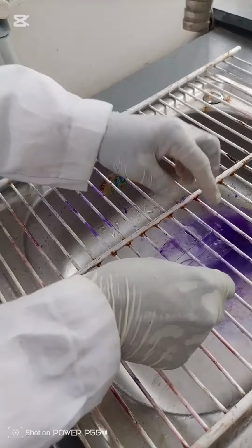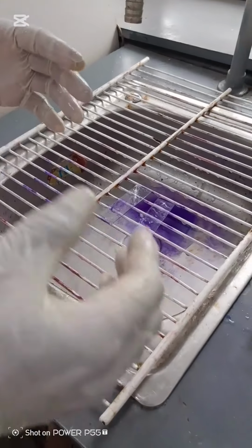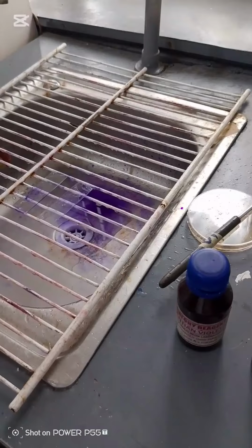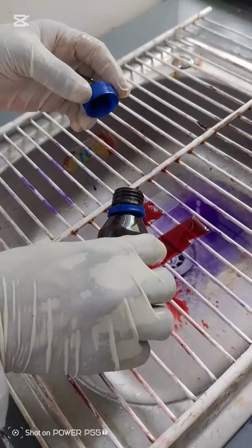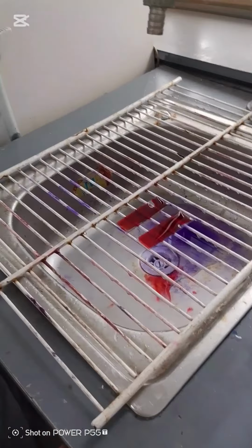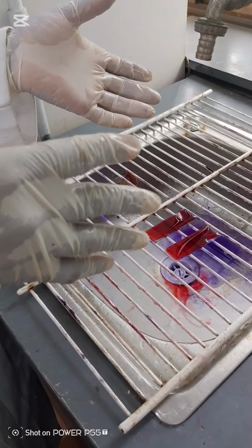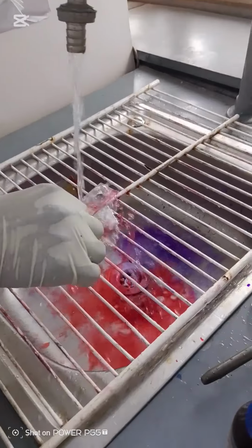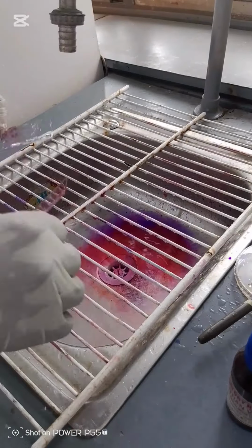As I said earlier, if it's a gram-positive bacteria, the primary stain will have formed a complex with it that you cannot remove with the decolorizer, so when you add a counterstain for 30 seconds, it will not pick the color of the counterstain, which is Safranin, because it has picked the primary stain. But if it's a gram-negative bacteria, it will be washed off by the decolorizer and it will pick the secondary stain. We rinse with water and examine under the microscope to know if it's a gram-positive or a gram-negative bacteria.